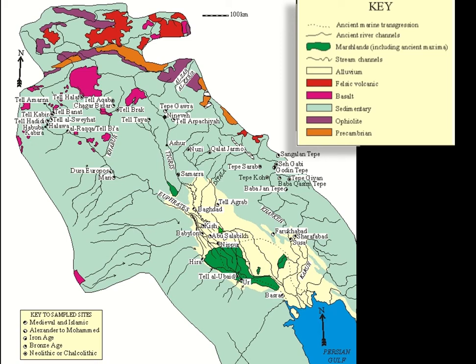But the rest of these pre-Islamic sites I sampled in order to just have a look at what they look like, so I could create a model for the Tigris-Euphrates basin, because as you have seen, there seemed to be limited evidence for the number of production centers. We had evidence for Basra, for the Hira or Kufa area, for Baghdad itself, for Samarra.